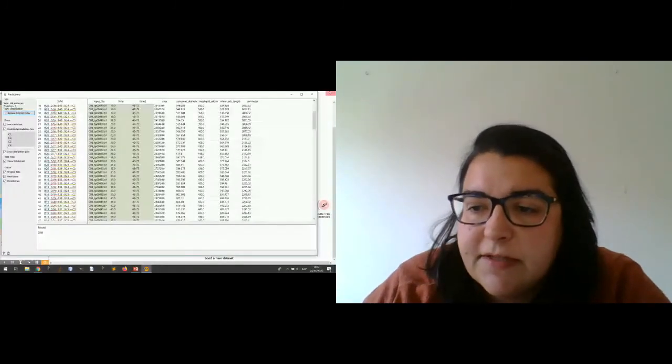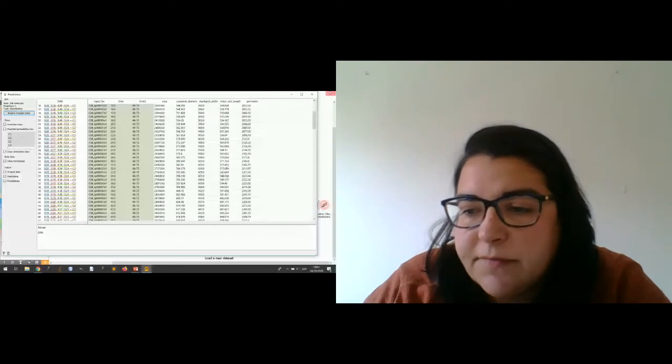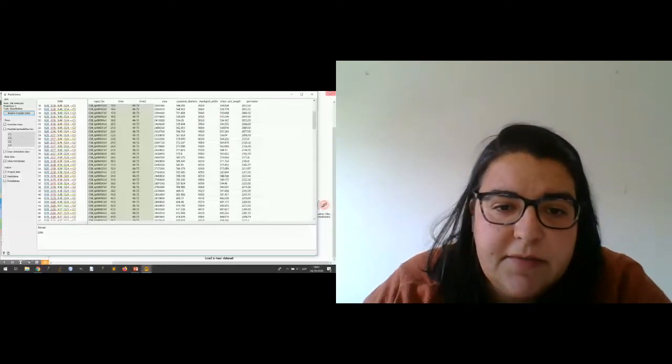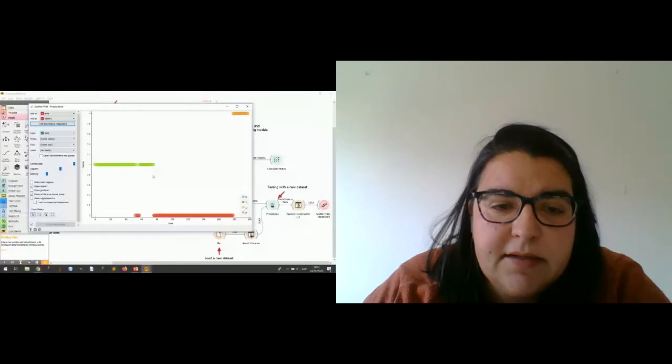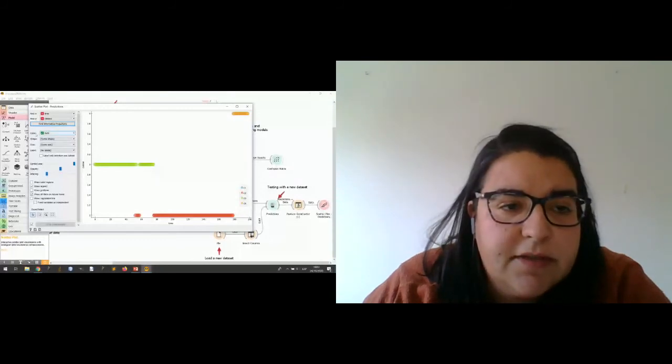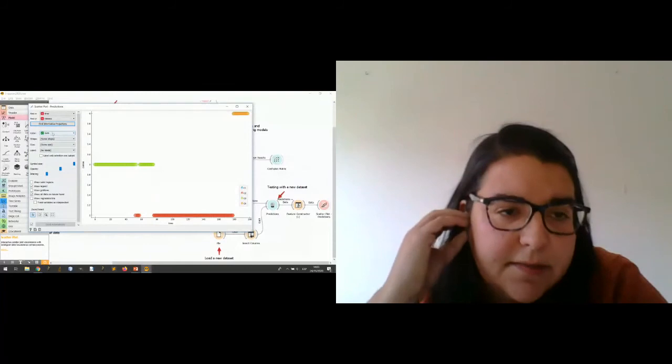Another way to see it is we use a scatter plot, and we can see that these are all the frames of the video, and these are the classes that they belong to, represented with colors. Okay, I represent the SVM clusters with color.